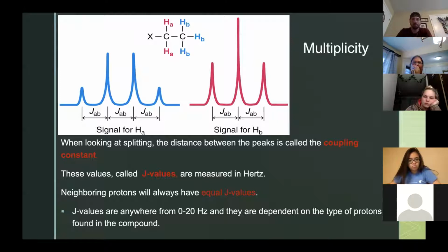I don't think you can see my mouse because Hutch is sharing the screen. The CH2 group, the methylene group, is split because of the blue hydrogens. You see that? The two HAs are not taken into account when it comes to the splitting. So these blue hydrogens are responsible for the 4 peaks that the methylene group shows.